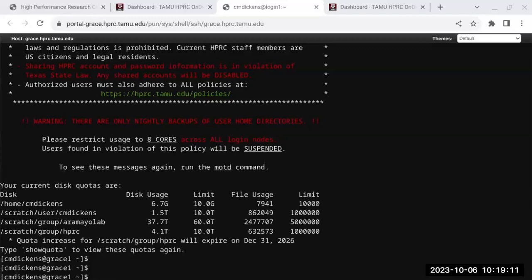Mate pairs are created a little differently. You can see single and paired end. The DNA prep is a fragmentation step, and you get a fragment size, meaning a double-stranded DNA fragment of around 200 to 500 bases, sometimes smaller. And then you have these adapters on each end, and you can sequence the forward and reverse strand if you're doing both, or just the forward strand.